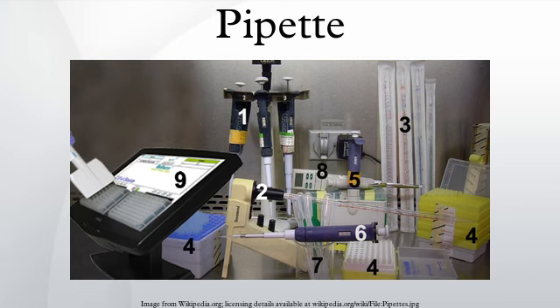Calibration. Pipette recalibration is an important consideration in laboratories using these devices. It is the act of examining or adjusting the quality of being near to the true value of a measuring device by comparison with a standard. Pipette calibration is essential to ensure that the instrument is working according to expectations and as per the defined regimes or work protocols. Pipette calibration is considered to be a complex affair because it includes many elements of calibration procedure and several calibration protocol options as well as makes and models of pipettes to consider.